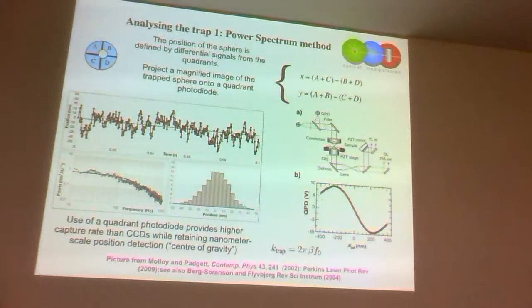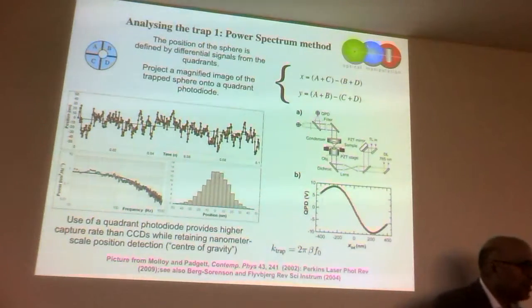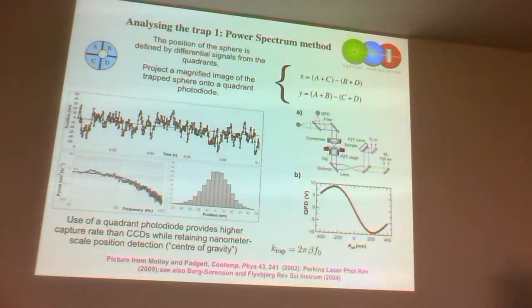Optical tweezers can measure the position of a single object to the accuracy of the Bohr radius at room temperature. That's pretty small, isn't it? You could do that, it's a single object. Okay, how do they do that? We use a quadrant diode, for example, so the object wiggles around. Here's my parabolic well from my Gaussian potential. It wiggles around, I image onto a quadrant photodiode. I get a jiggly signal as it's doing Brownian motion. Over long time scales, it explores the edges of my trap.